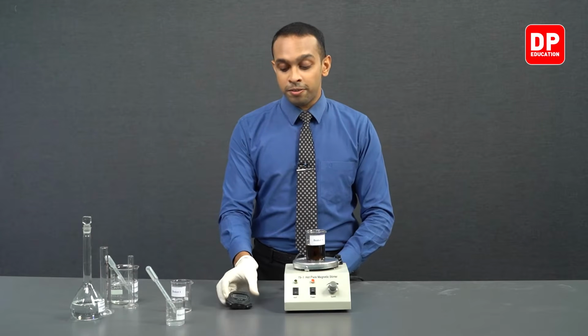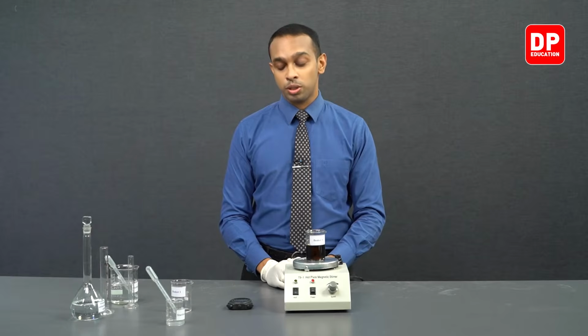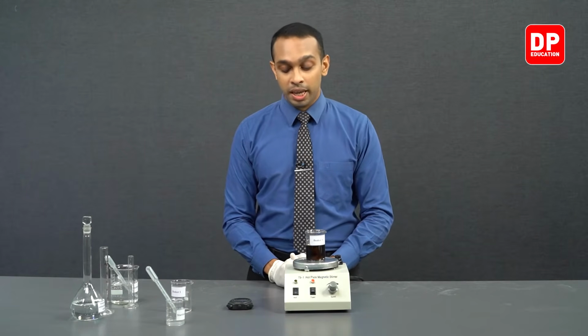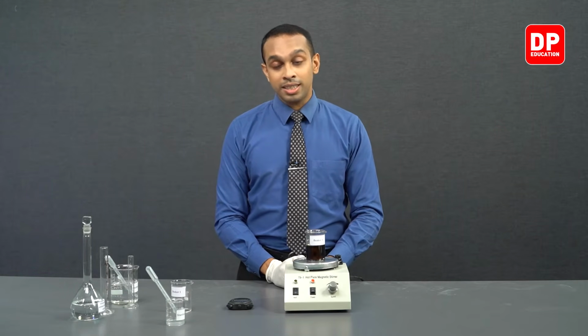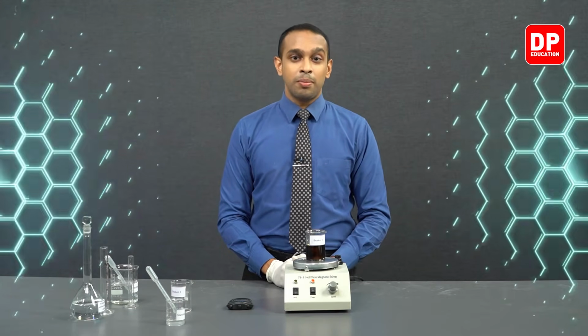So for the first Fe3+ ion concentration, the time taken was 2 seconds. For the second one, it was 8.10 seconds. Now let's move on to the third step.